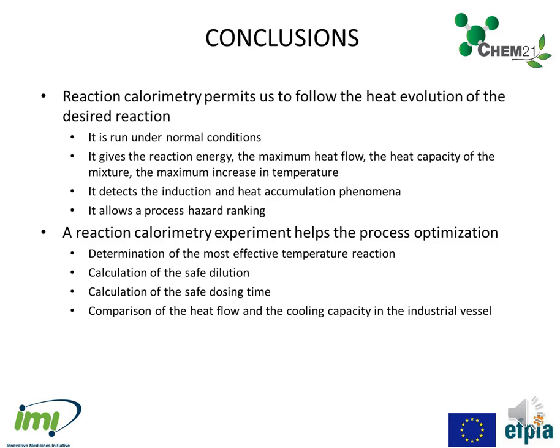In conclusion, reaction calorimetry permits us to follow the heat evolution of the desired reaction. The reaction is carried out under normal conditions. The calorimeter measures or calculates the reaction energy, the maximum heat flow, the heat capacity of the mixture, and the maximum increase in temperature. It detects the induction and accumulation phenomena, and it allows a process safety ranking.